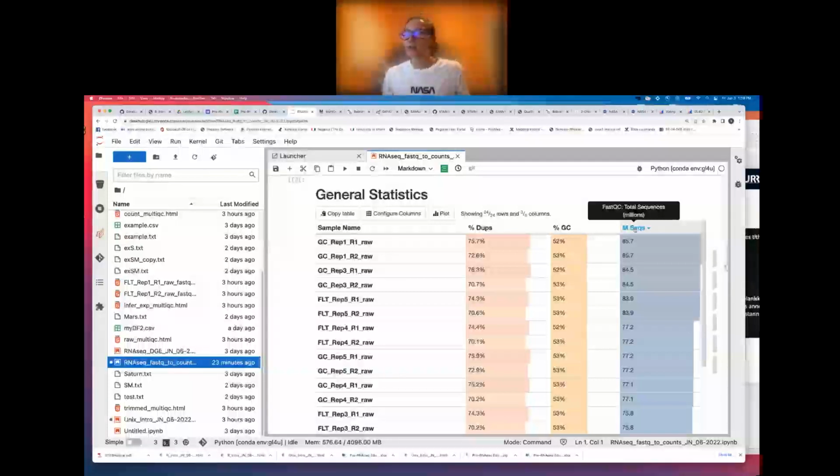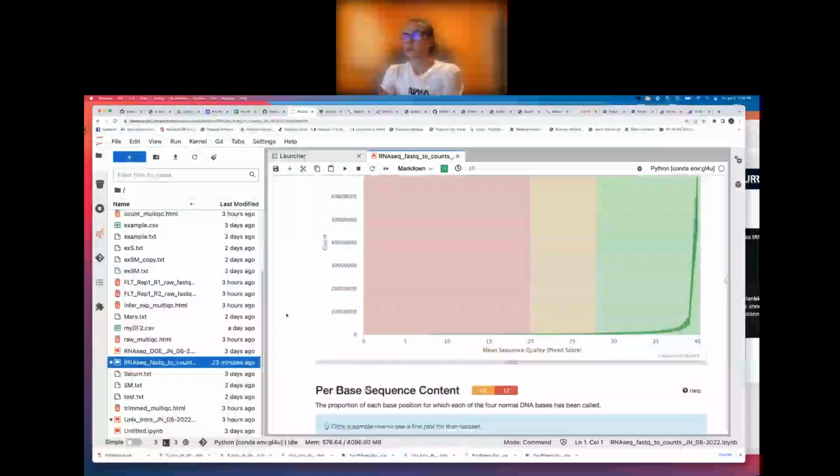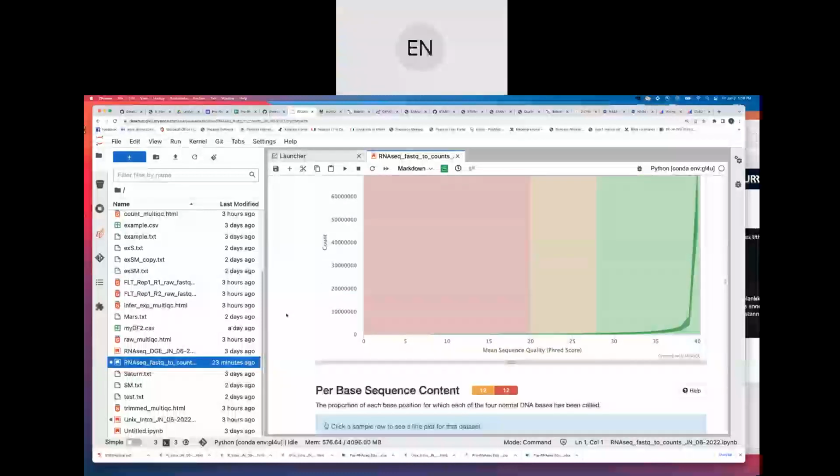So you really want these to be as close as possible to one another, even though you're going to normalize for it. I account for that when I look at the data. If you see double the number of reads in some samples than others, I'd be a little concerned. Within 20 to 30%, probably not too much. Maybe some lower expressing transcripts might come up in the samples that are sequenced a little deeper. But Amanda, is that because the amount that was loaded differed?